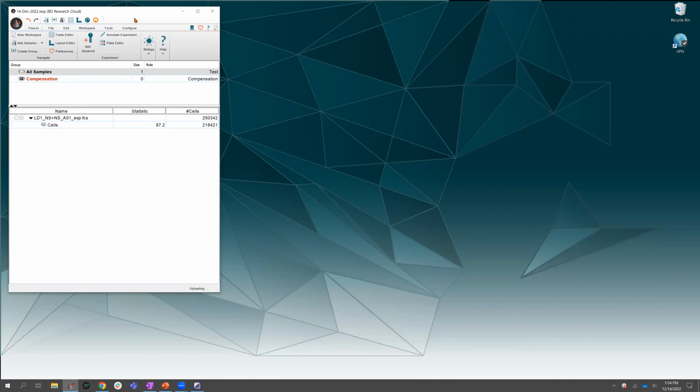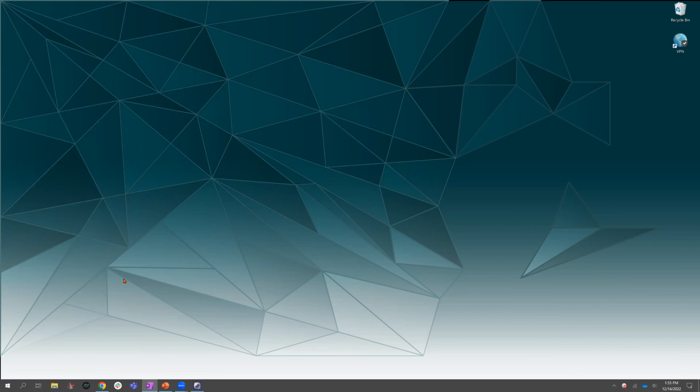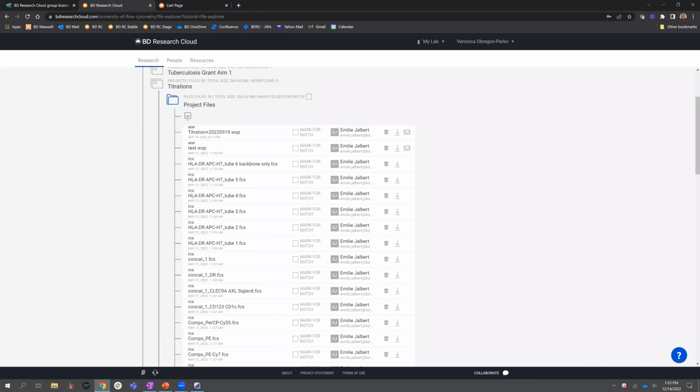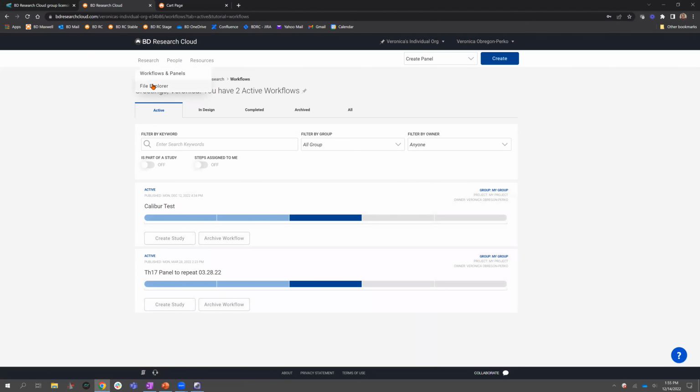Okay. Now, let's say I come back another day. I'm ready to retrieve this workspace. How can I do that? All right, let's go ahead and save those changes. And let's go ahead and quit FlowJo, pretend we're starting a new session. Right, and if I go back to the Research Cloud and go back to my individual org, right, I'll likely be able to see that in my File Explorer now.